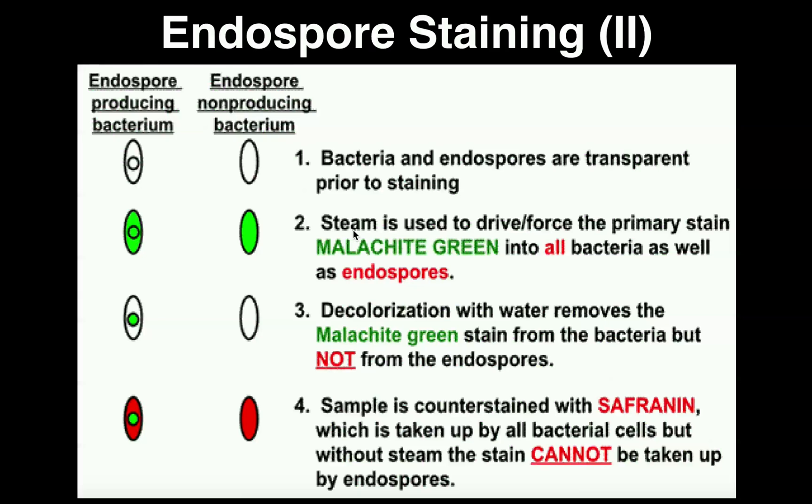Then we're going to decolorize. Unlike the other two stains we've done — the acid fast stain and the gram stain — the decolorization here is done with just water. There's no actual decolorizer or acid alcohol. We just decolorize with water, and notice what happens: the endospore inside the endospore-producing bacteria retains the green color, but the actual cell around it is colorless. If we have an endospore non-producing bacteria, the entire cell is colorless.